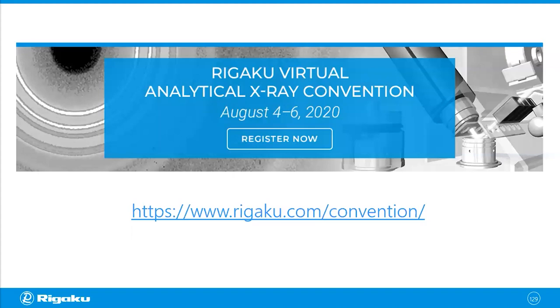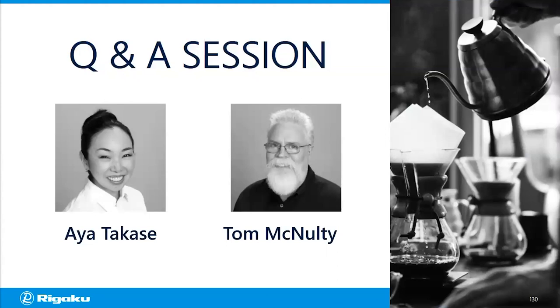Okay, thanks, Aya. Very interesting. And thanks again for presenting. And certainly we have some time for some Q&A. Looks like we have a number of questions that have come in today. So first one says, is there any way to do indexing of grains simultaneously during the measurements?